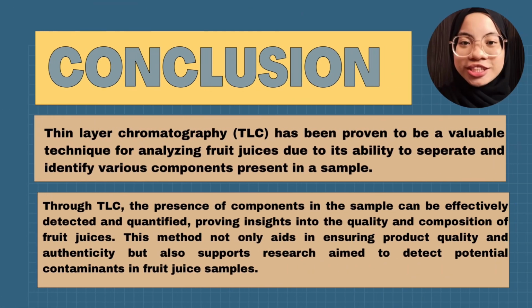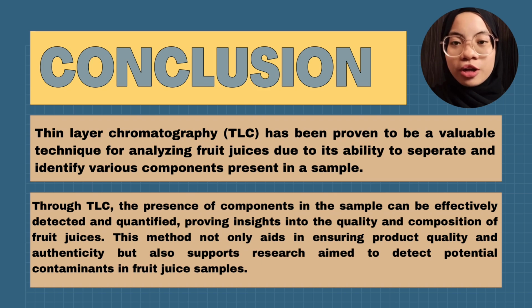In conclusion, thin layer chromatography, or what we call TLC, has been proven to be a valuable technique for analyzing fruit juices due to its ability to separate and identify various components present in a sample. Through TLC, the presence of components in a sample can be effectively detected and quantified, hence providing insight into the quality and composition of fruit juices. This method not only aids in ensuring product quality but also supports research aimed at detecting potential contaminants in fruit juice samples.